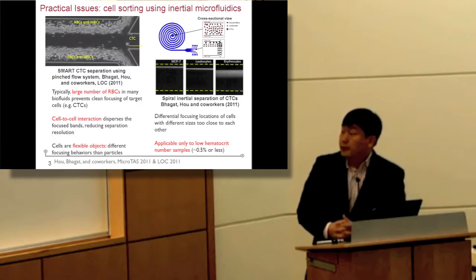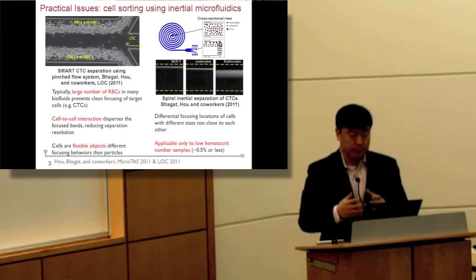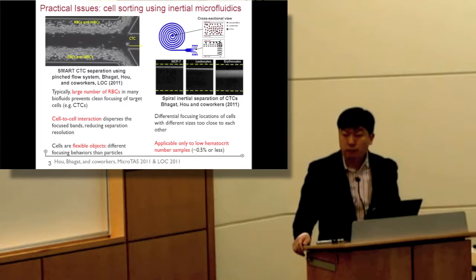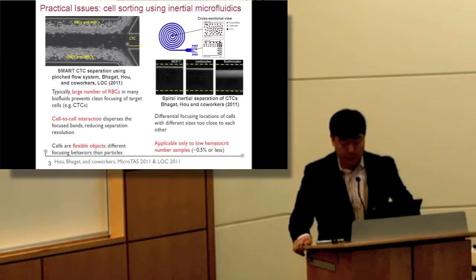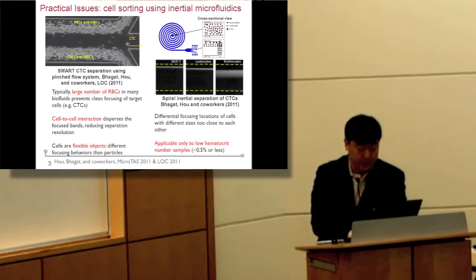We have been working towards applying some of these innovative concepts for sample preparation of biofluid, especially for separating background cells from various kinds of biofluid, including blood and others, and perhaps collect the rare cells. And this is not a new concept, and many groups are working on this. We have had many successes, but still there are a number of challenges remaining. Some of those are really obvious.